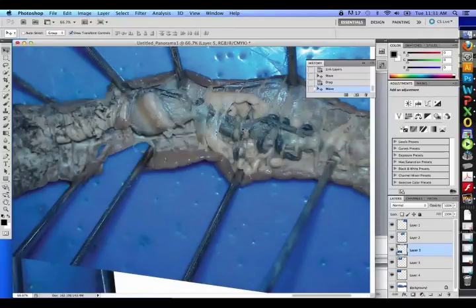There is also your dorsal blood vessel. It runs the whole body and carries the blood around to carry nutrients and, well, oxygen not really, because that goes across the skin, but the nutrients definitely. And it'll carry it to all the parts of the body.